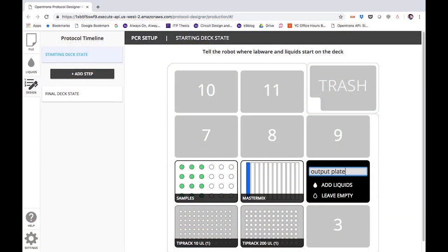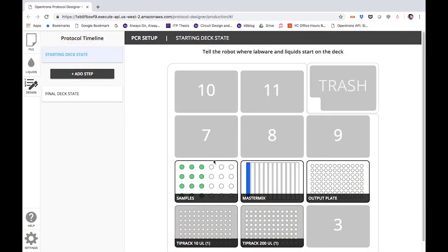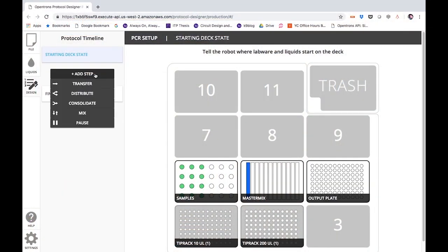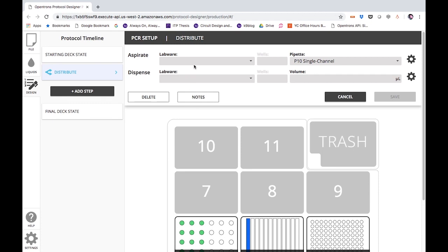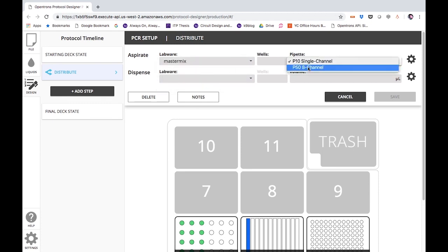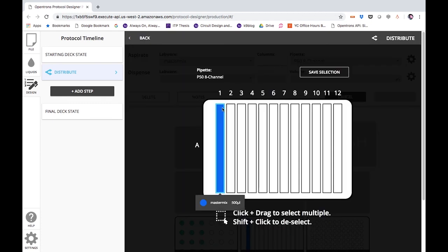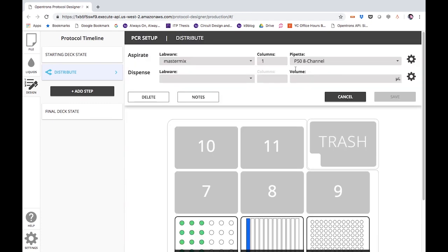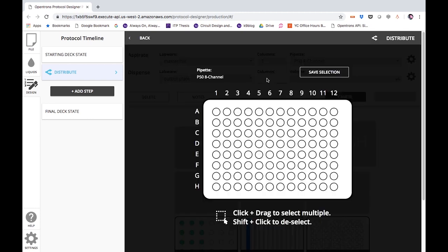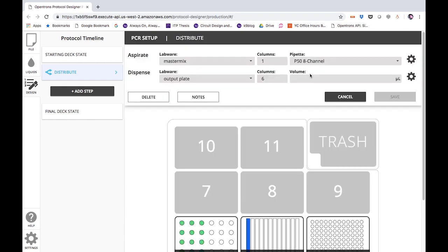The first step is to design your experiment using one of our online tools. You can start from scratch using our Visual Protocol Designer application to choose your labware, reagent starting locations, and define each step of your protocol.